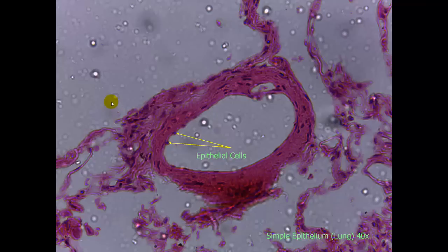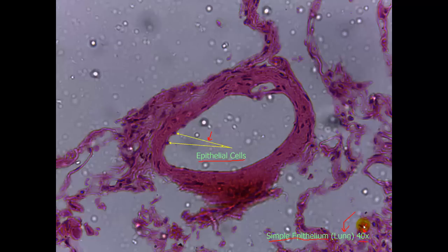A couple of things to note before we get started: there are often labels within the slides themselves pointing out what you are trying to look at, indicated by yellow arrows. At the bottom, we have the description of what you are looking at, where it is found, and at what objective magnification. Note that this is just the objective, not the total magnification. To find total magnification, multiply that value by 10x.